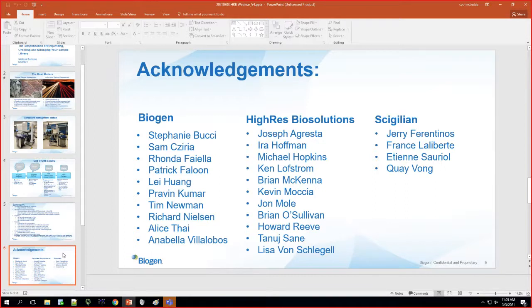Next question: does COB allow for more than one intermediate plate? Yes. It depends on what you order, but COB does all the assignments. So on big orders of maybe 1,000 or a couple of hundred compounds, there will be multiple intermediate plates. That is all calculated by COB. You don't have to figure that out at all. But yes, it often has multiple intermediate plates.